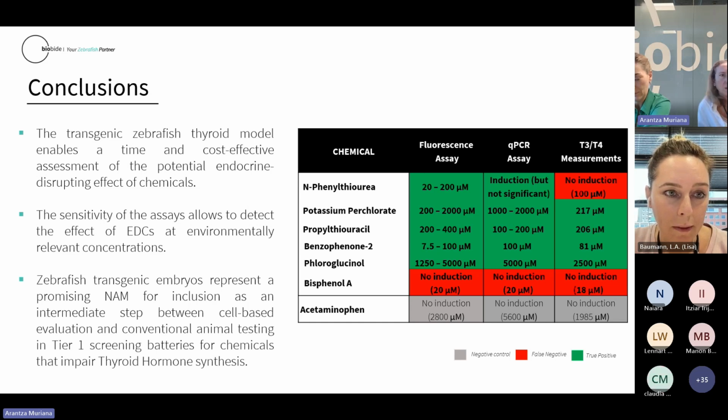Yes, we tested ampicillin and it's also negative. Its response was like acetaminophen, no effect in any of the three assays in zebrafish, so we are quite confident with that, but it's not included in this work. We tested that control because we wanted to compare with the other models. Yeah, but it's true that usually when we are validating our assays, the most difficult thing is finding good negative controls or reference products. It's always the tricky part. That's why we include only one, two, or three, but sometimes there are no other solutions.